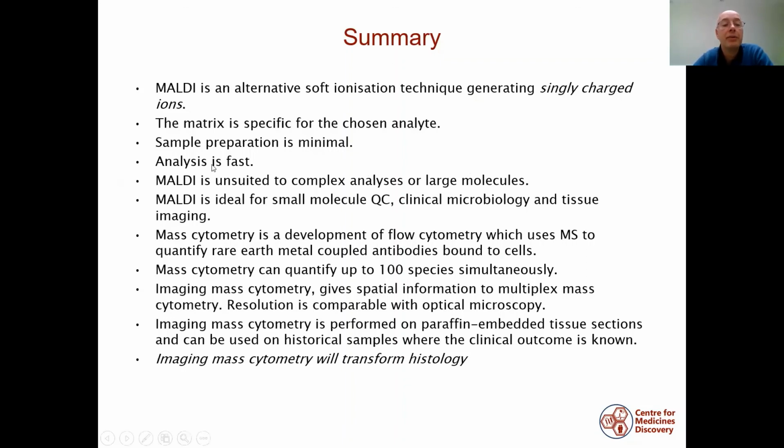As I've said a number of times, MALDI is not suited for complex analyses, and it's also not suitable for analysis of large molecules, but it is ideal for small molecule quality control. It's ideal for clinical microbiology, as I explained in the biotyper application, and also in tissue imaging.